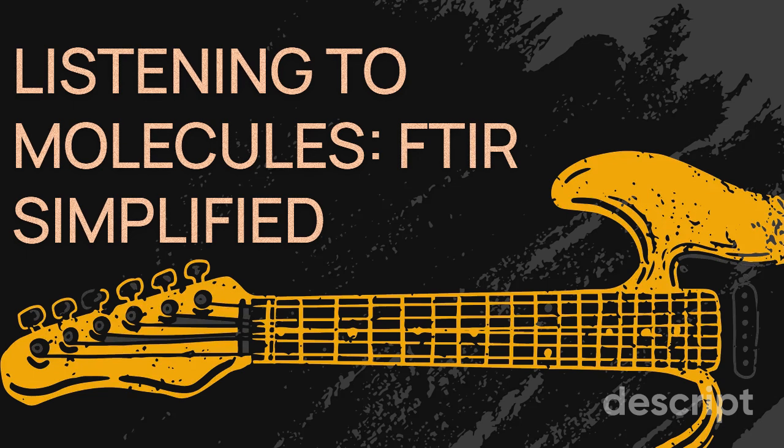This is all so mind-boggling. It's like we're peeling back the layers of complexity in the protein world, revealing those intricate details that make life possible. And it's all thanks to these incredible tools like FTIR and HD exchange that allow us to explore the molecular world with such precision. Okay, we've been focusing a lot on the dynamics of proteins.